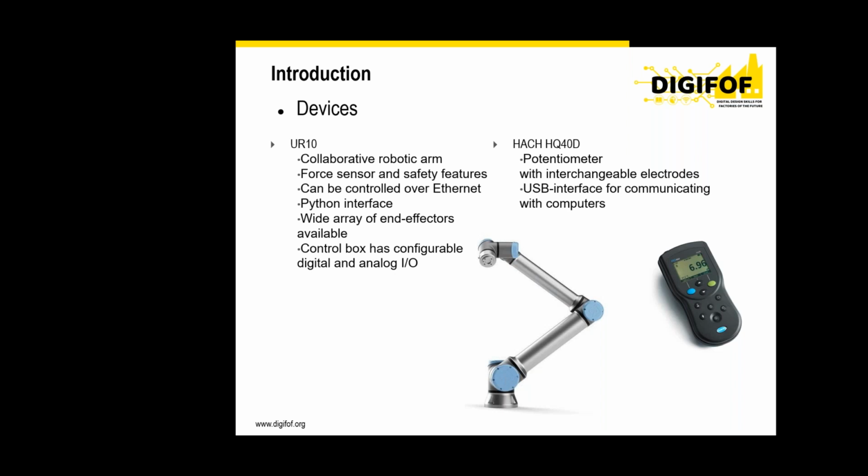So there were either optical fences or physical fences, so that anyone being inside the robot working area would cause the robot to stop, and that way not harm anyone nearby. So in recent years, there has been a lot of research and development and already commercial products available where the robotic arm is designed in such a way that it can collaborate with a human being. Then the robotic arm is defined and designed that way that it will not harm a person. So it has only certain strength and speed, so that anyone being close will not be harmed.